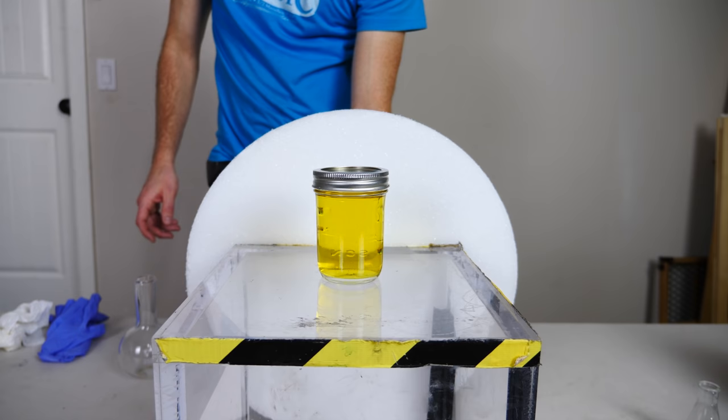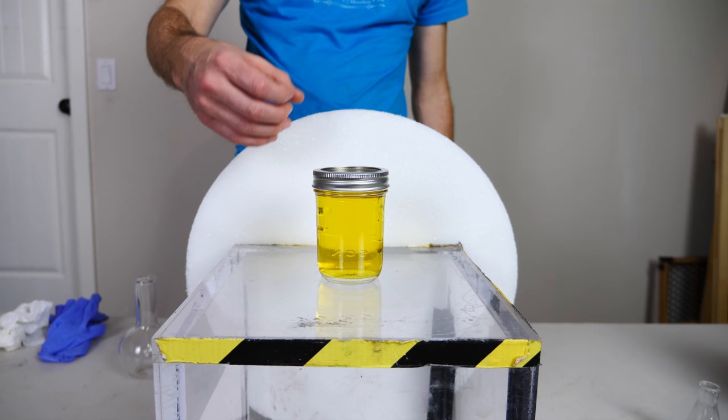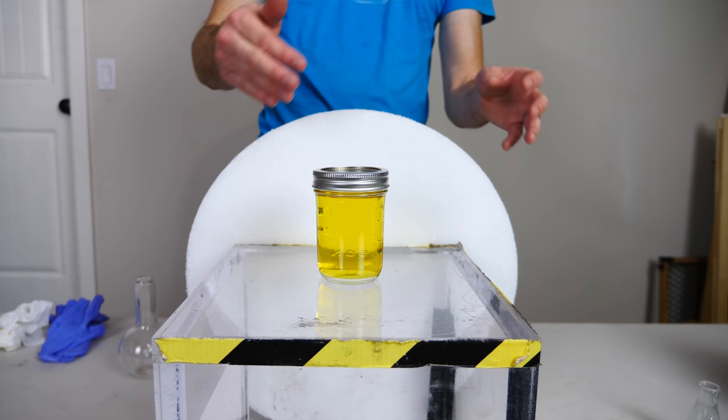Now the way this is working is when it's in this yellow state, that means that the indigo carmin is absorbing all of the blue light. That's because the molecule is completely reduced, so it can absorb the shorter wavelength light.